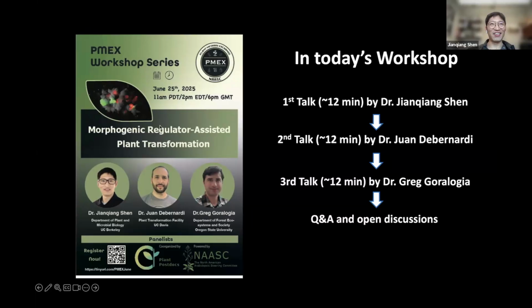For sorghum, with the morphogenic gene you can get shoots regenerated immediately, but without it, the tissue will stay at callus or immature embryo status for a long time. So using the morphogenic gene is a good way to filter out the chimerism of the transformation.